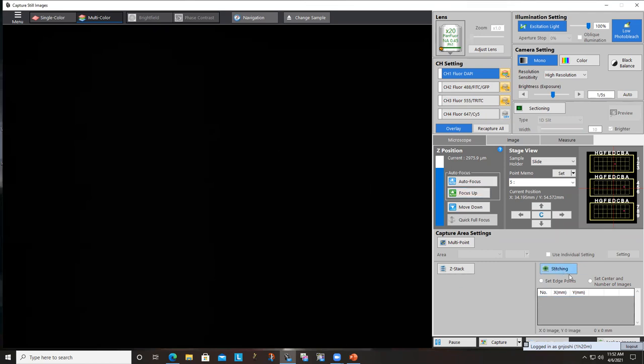So now this means I'm no longer using the stitching parameter, right? So as I said earlier, let's say I'll go and delete all these points that I had acquired yesterday. I'll say, yes, I don't want to look at any of them. I know my sample is right here. So this was the second step we talked about, which is looking onto the sample. So I'm manually looking at my sample.